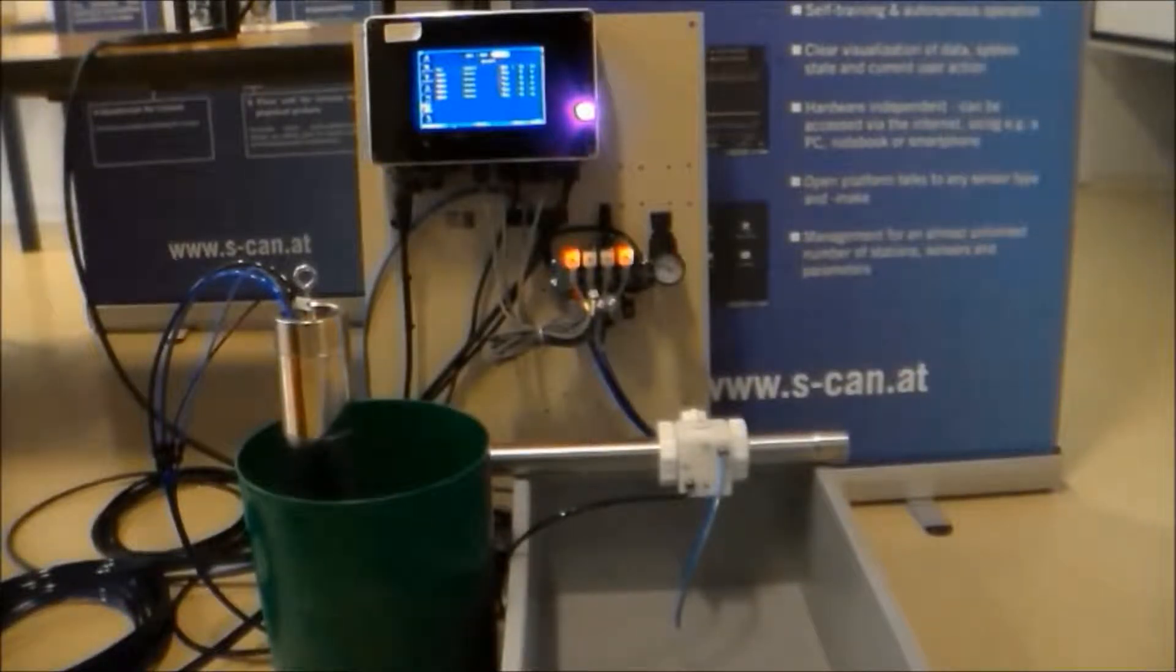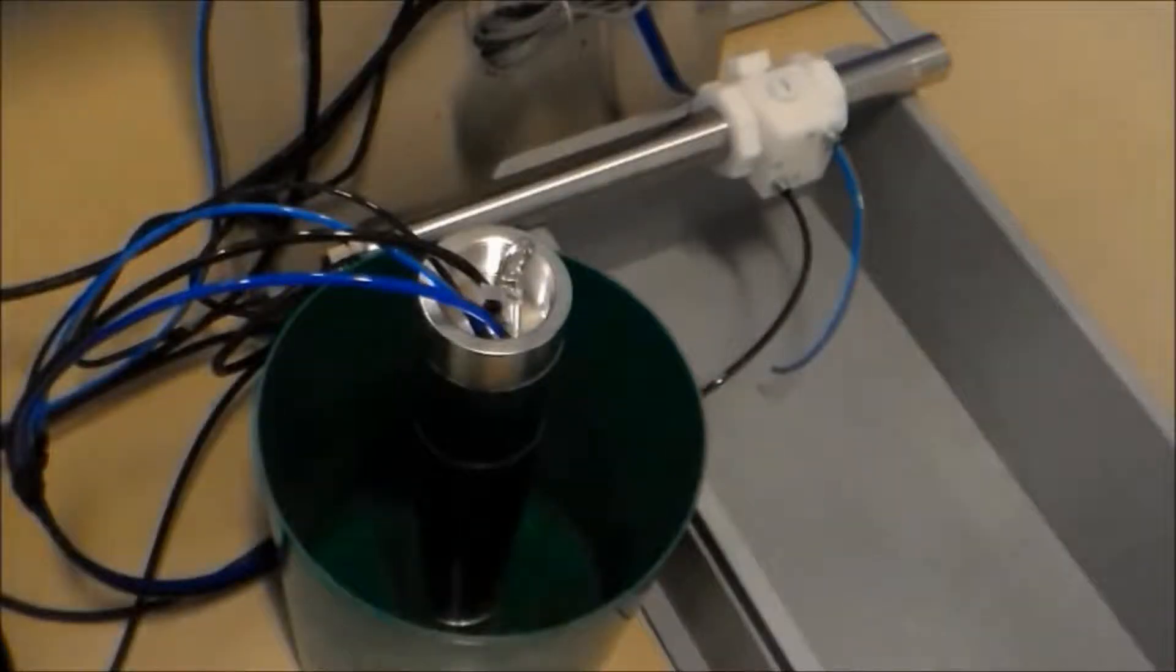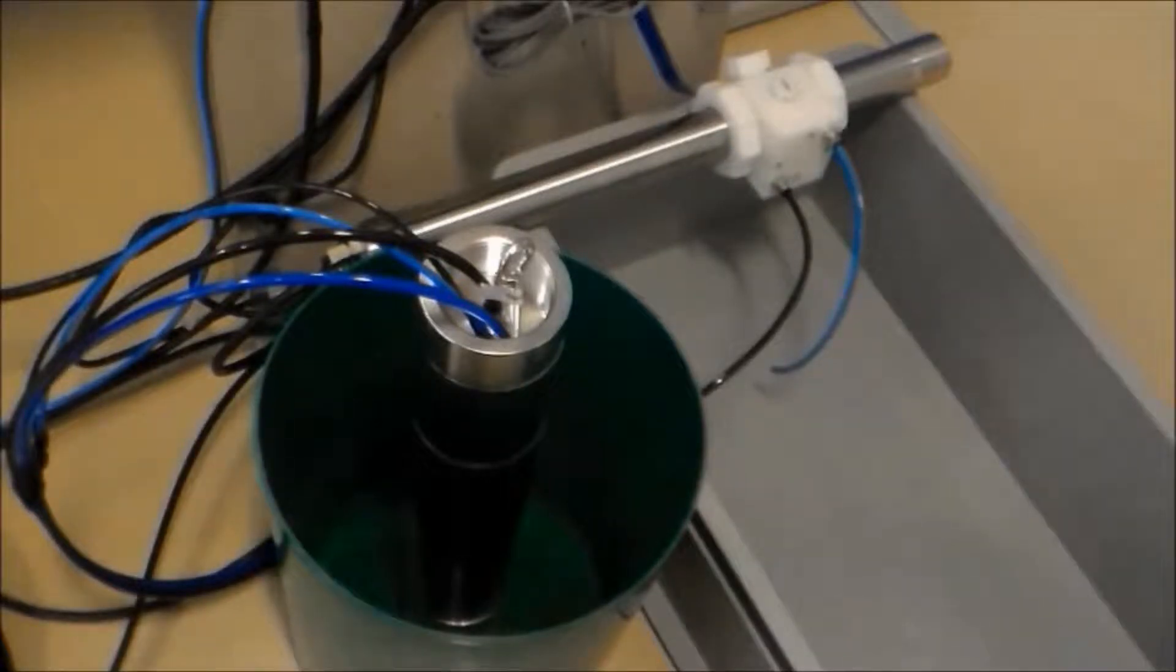In the following step, another valve opens and pressurized air is used for automatic back flushing of the pump. The valve closes again and the procedure is finished.